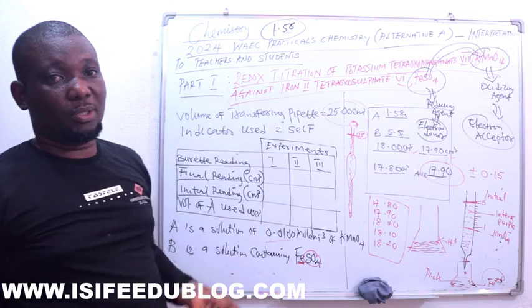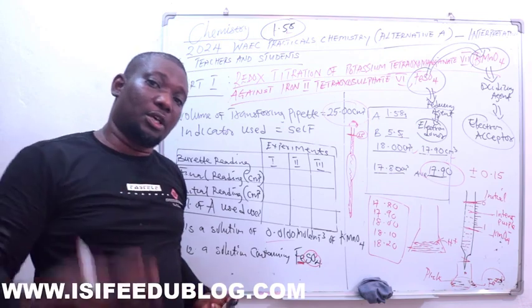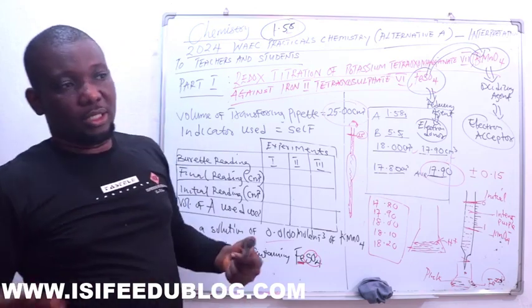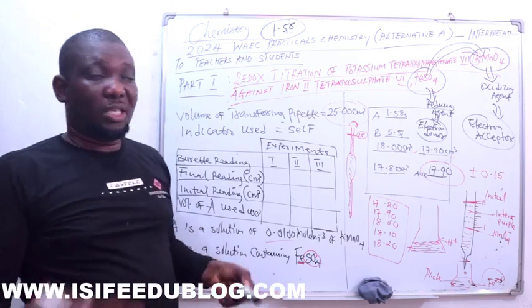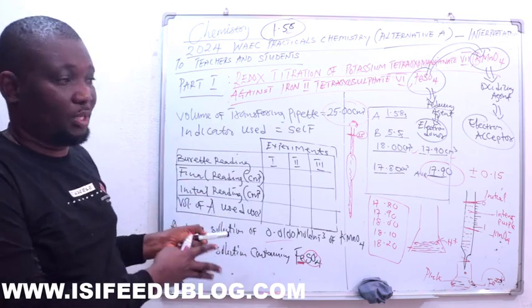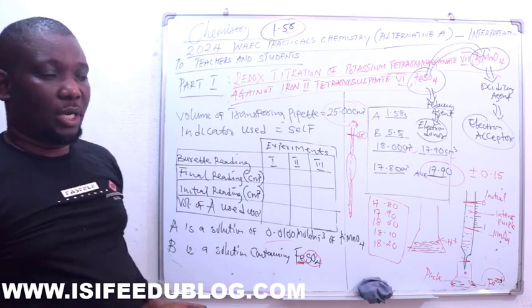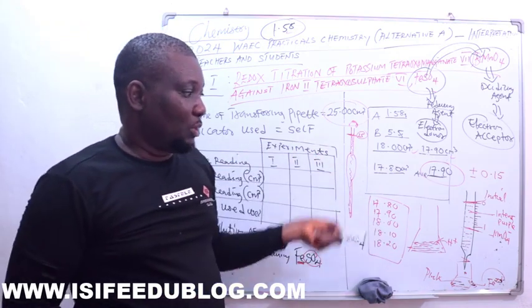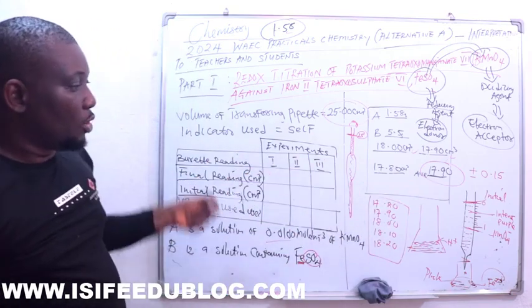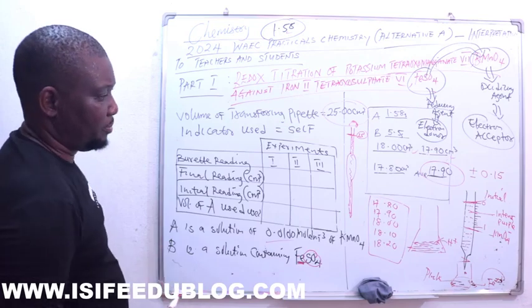It's not like a normal acid titration where they already know the indicator is used, already know the indicator is this color in acidic medium and this color in alkaline medium. So 90% of these students that have to write this might not have done this kind of experiment. The only thing that can be done is for them to have a clue what the end point looks like, so that when they are doing it in the hall, it will be a confirmation. So now coming to this point, this is what I want to choose for my experiment.